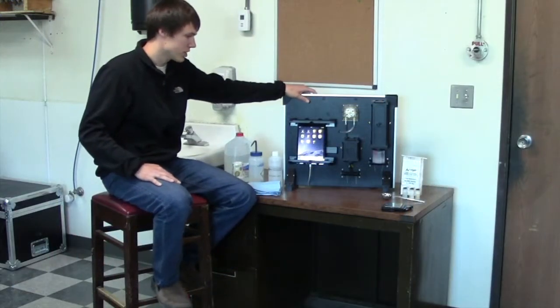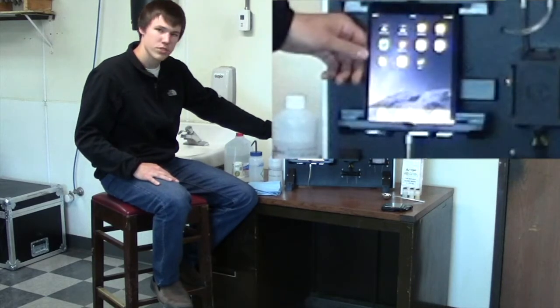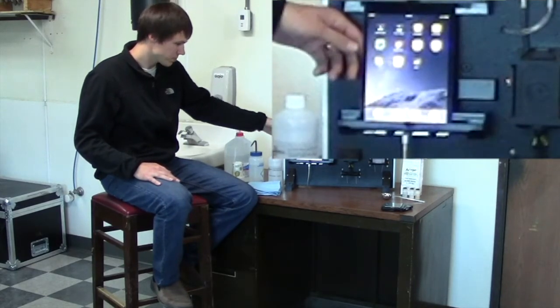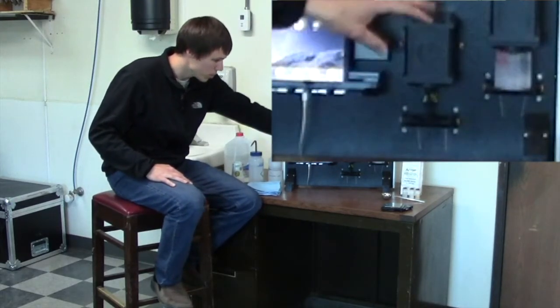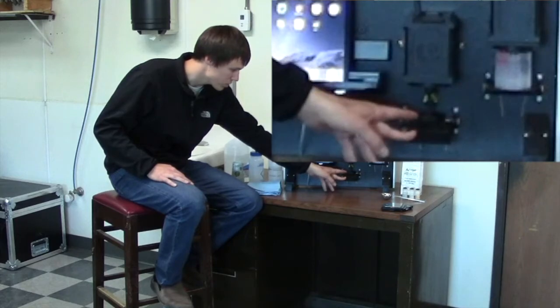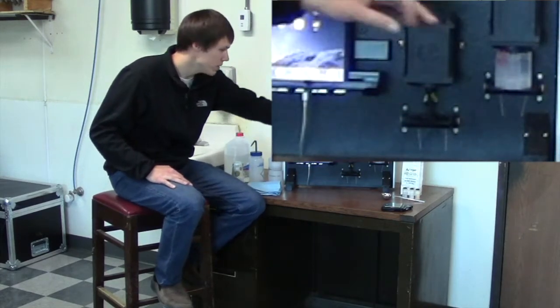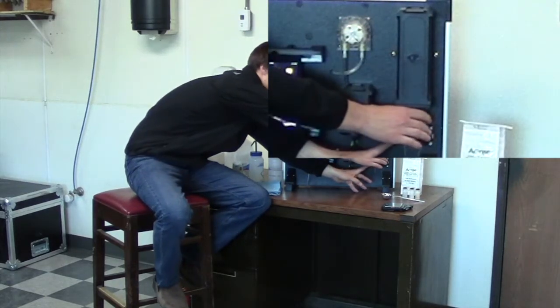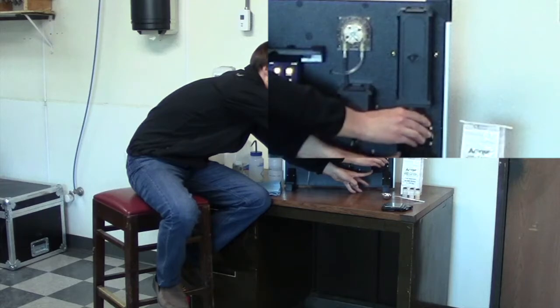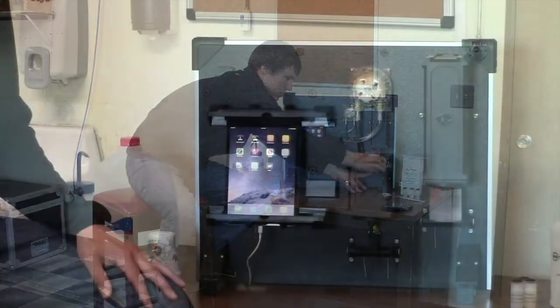Starting out with our soil scan, there's really three main parts. First would be the iPad, and this is truly the brains of the operation. Next is the mixing station, which consists of a small motor in this box and a paddle which rotates when the motor is engaged. The third part would be the actual sensor. If you look closely on this soil scan or your own, you'll see that there are multiple tips to the soil scan. And this is actually what reads the nitrate levels.